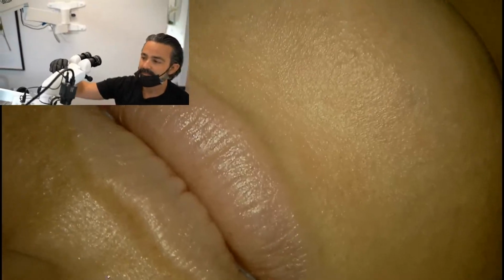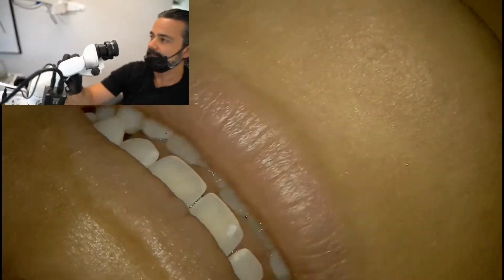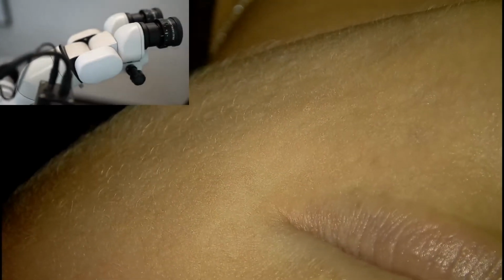Get in on that. Can you turn it towards me just a little bit? Like this. Yep.